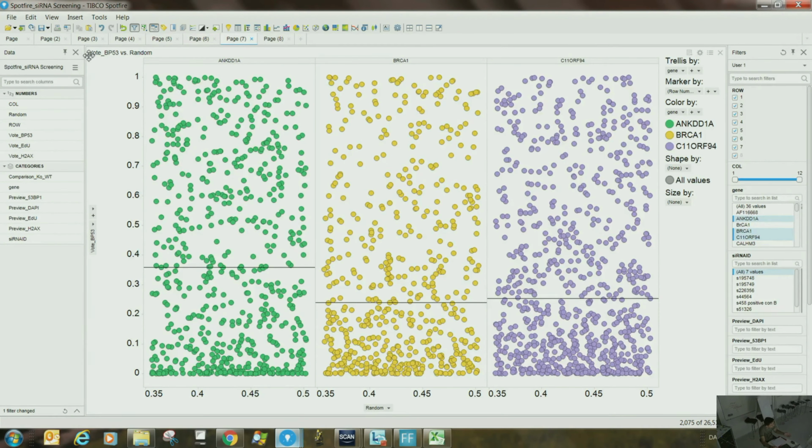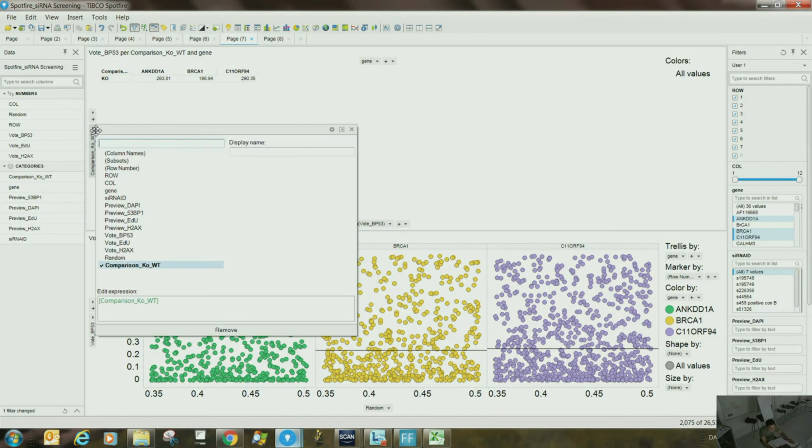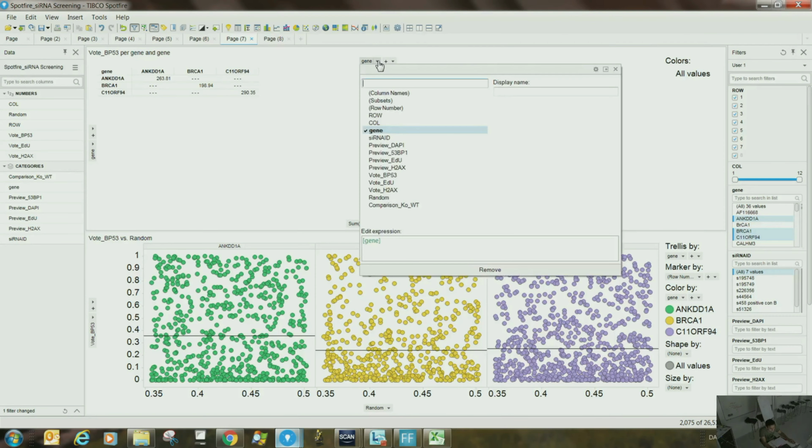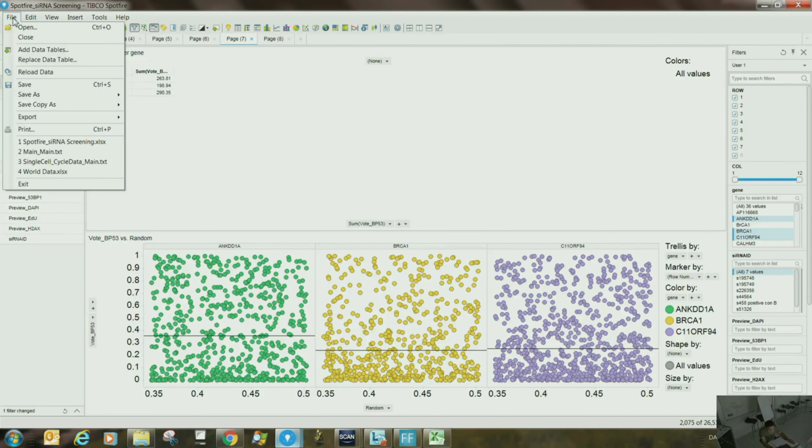Let's say if you do some calculated columns and stuff like that, or maybe this one. This is very interesting. I said before, right? So you can have this multiple stuff for different genes, for example, here. You got my point. And then you can just go here, export data to file.